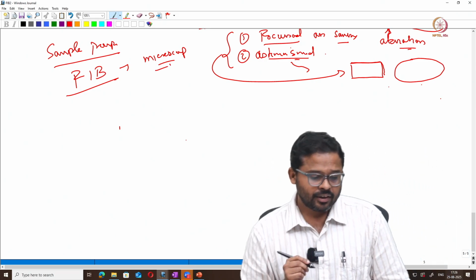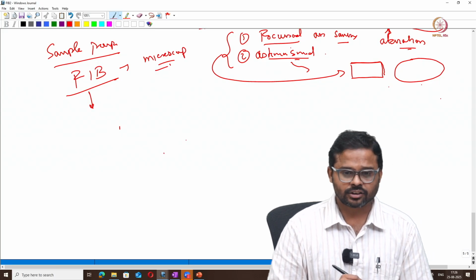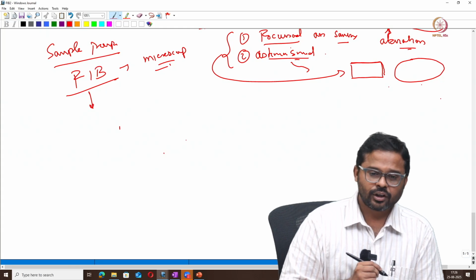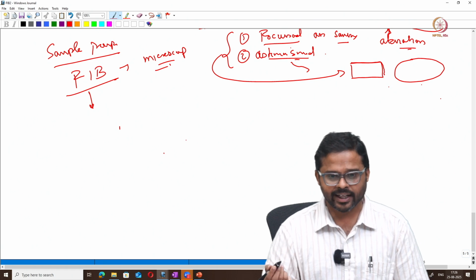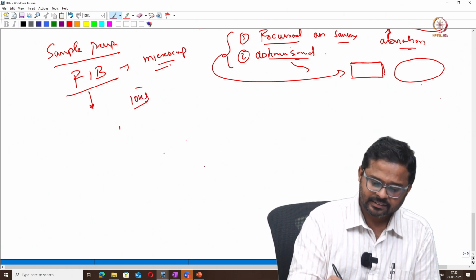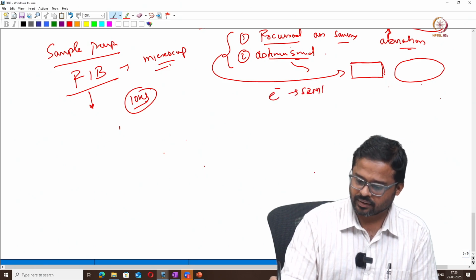And we have described the basic cross section of the column and what the important lenses are. We call them electrostatic lenses. I explained why electrostatic lenses are used, not electromagnetic lenses. That is because these are ions, not electrons as in SEM or TEM, correct.